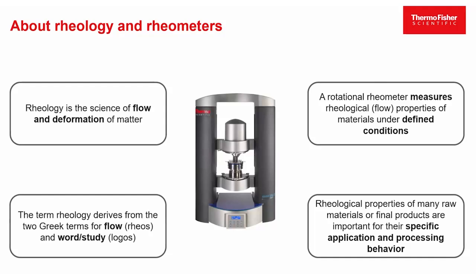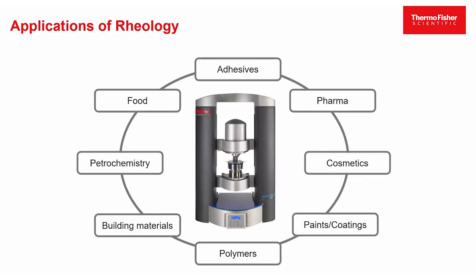Many people associate rheology with the determination of viscosity, but actually there's more to rheology than that. Many materials can be characterized regarding the flow behavior, and this is for many raw materials and final products crucial to get some information about specific application or processing behavior. As you can see on this slide, rheology is used almost everywhere.